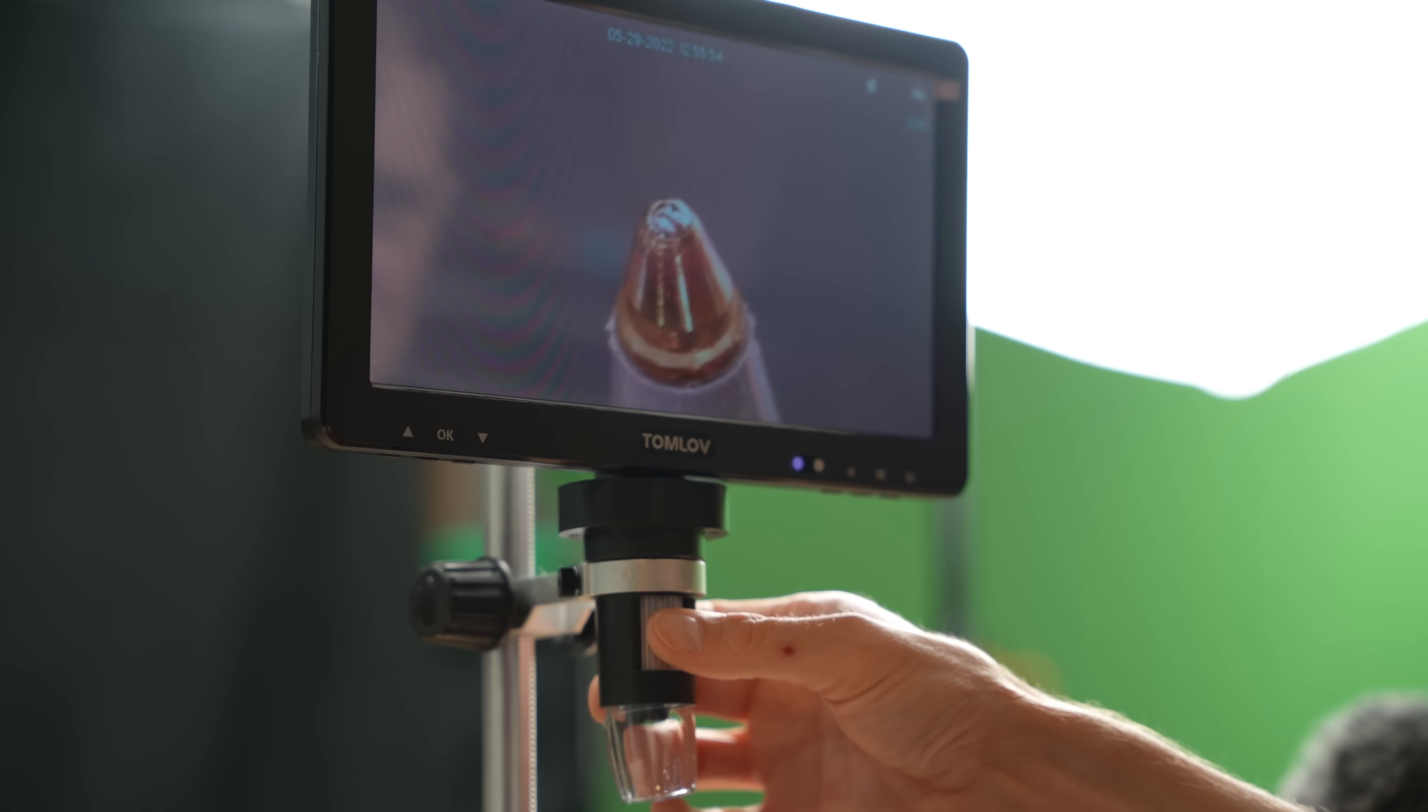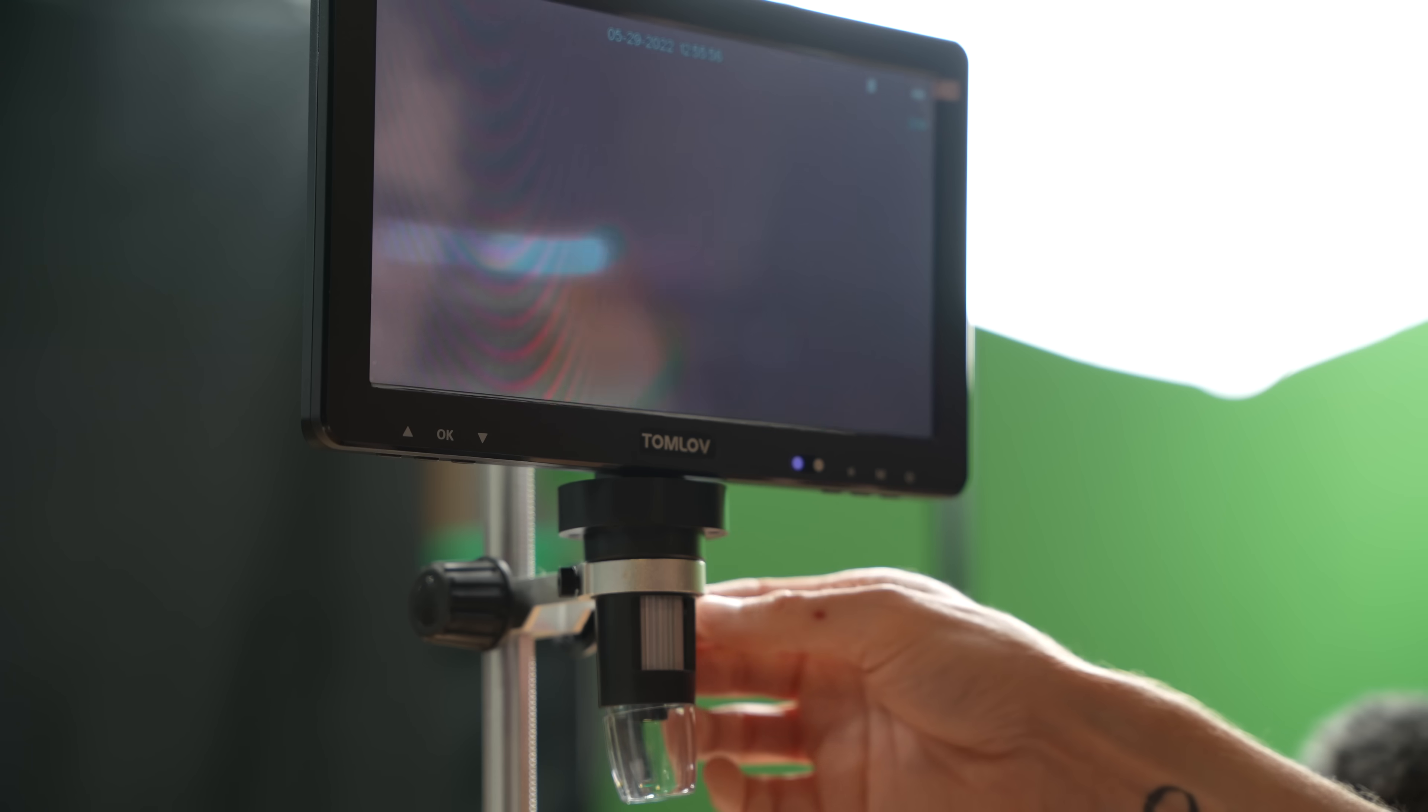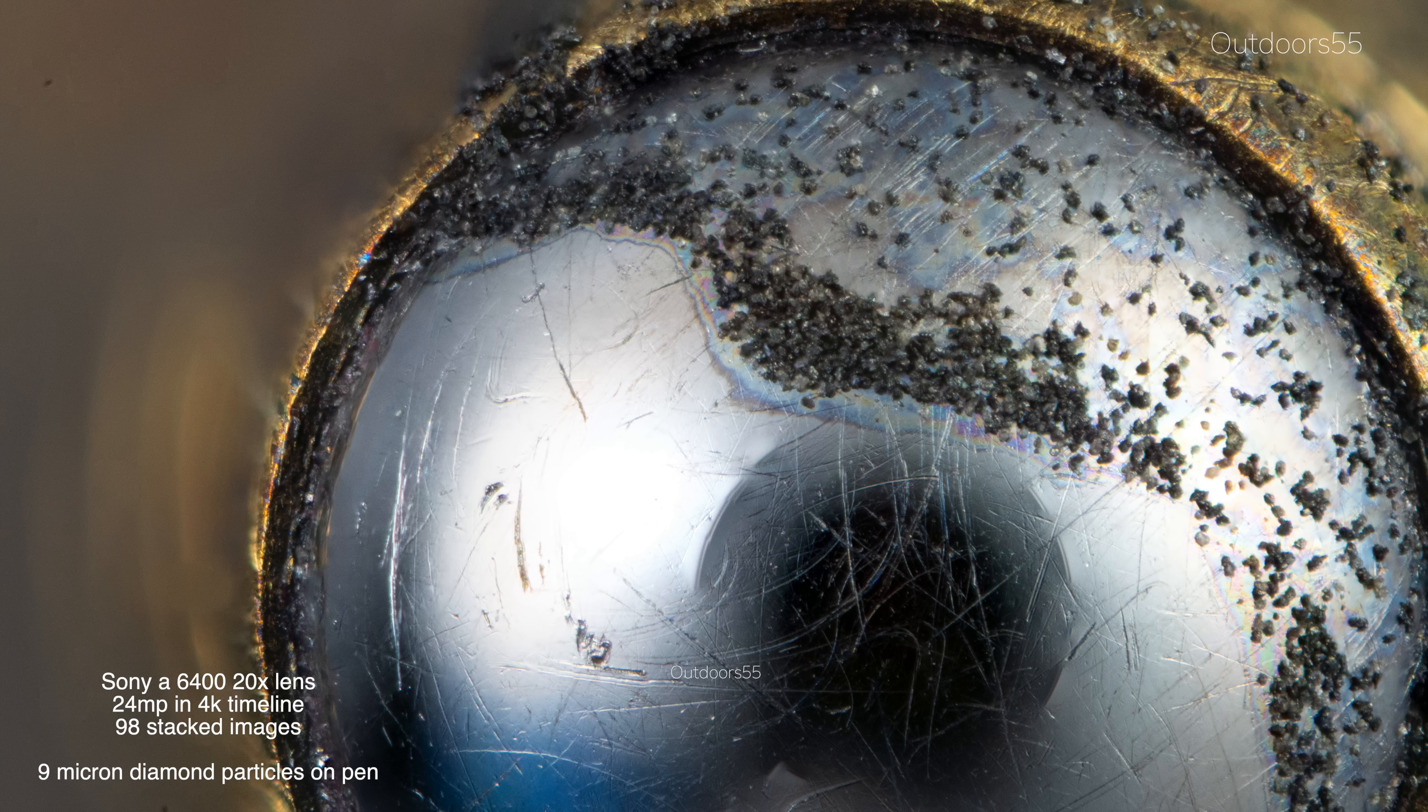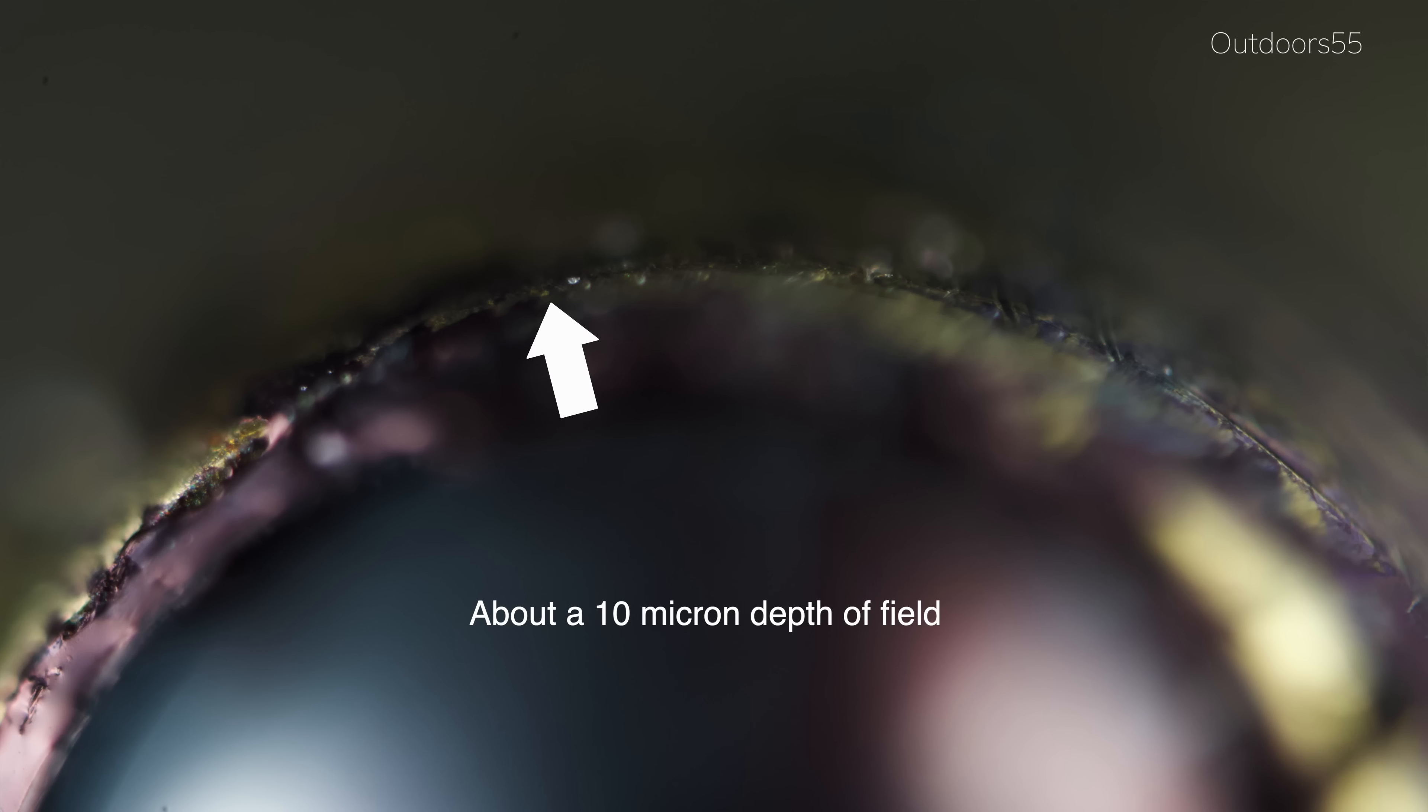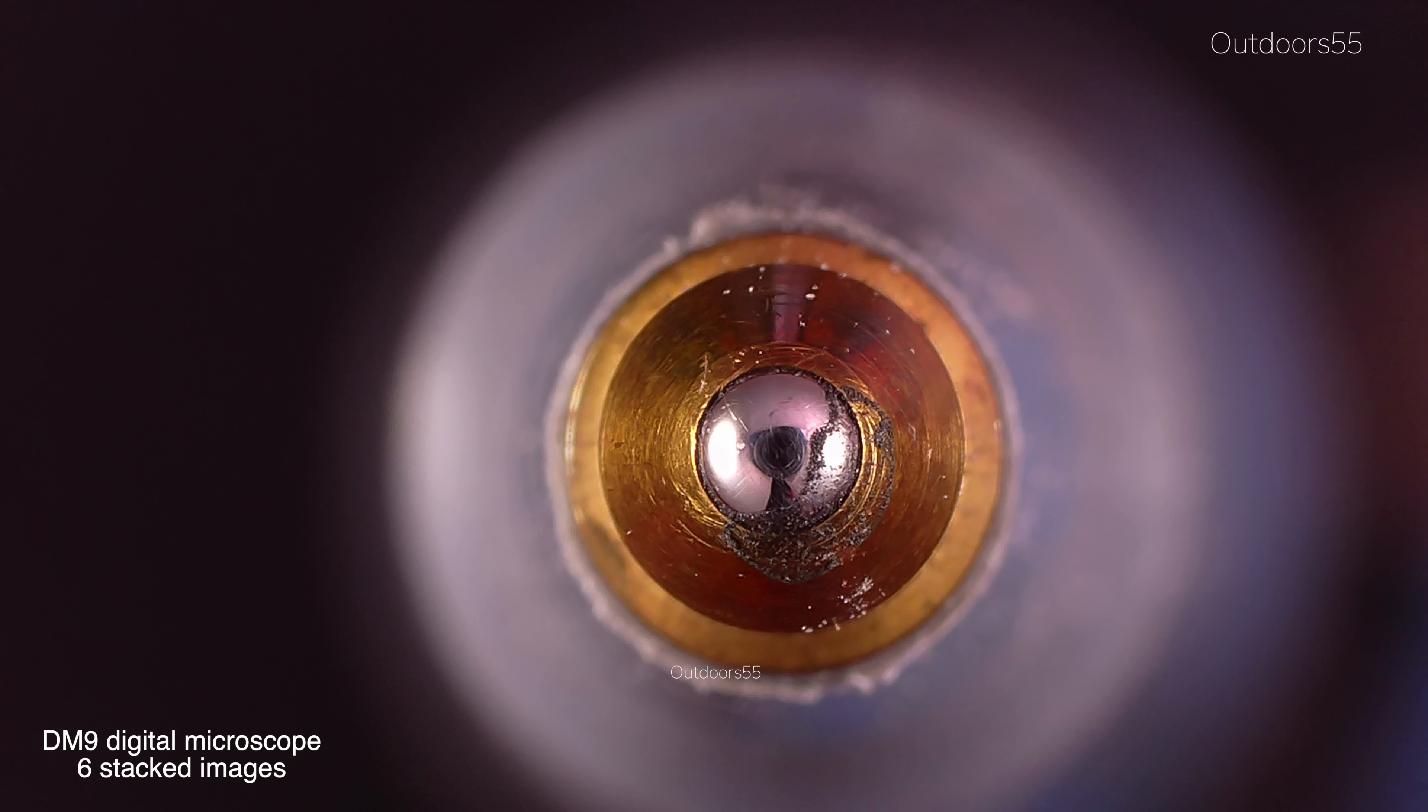Now this is why for most of these digital microscopes, you really won't be able to get photos that look like this. It's simply not possible to get this close up to something and take a single picture and be able to see what it is that you're trying to look at. Since the depth of field gets so small for some higher magnifications that an individual picture will just look like a blurry mess, with depths of fields getting down to just a couple of microns across. You physically won't be able to see what you're trying to look at since the depth of field would be too small for the vast majority of things.